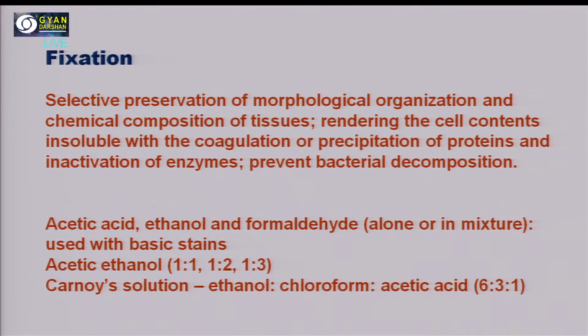After pre-treatment, what you need to do is go for the fixation. What is the purpose of fixation? Selective preservation of morphological organization and chemical composition of tissues, rendering the cell contents insoluble with the coagulation or precipitation of proteins and inactivation of enzymes, and preventing bacterial decomposition.